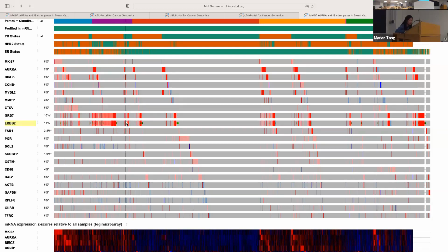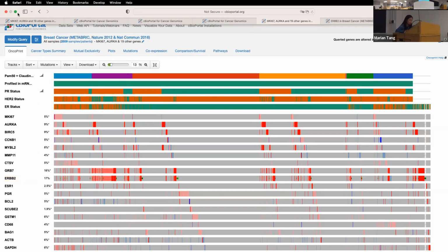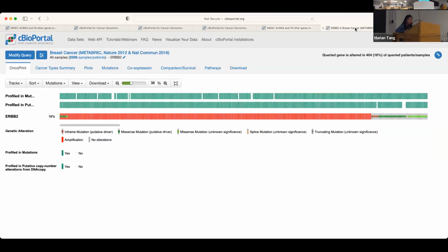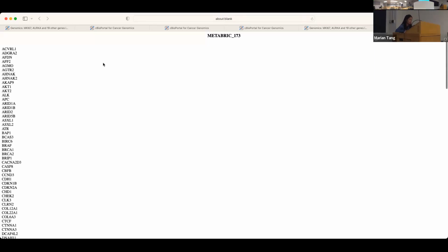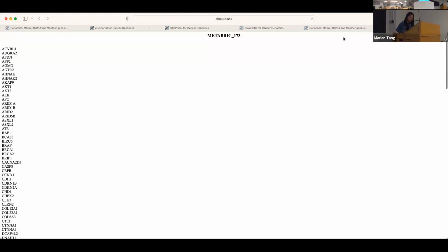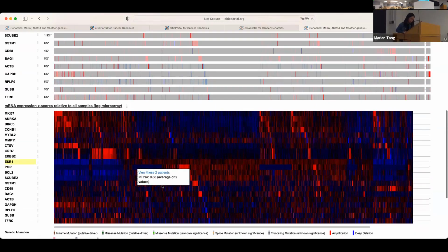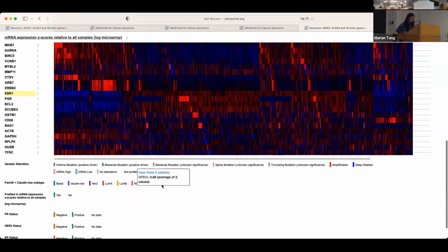So now you can see there's this field called gene panels. So if we click on it, oh shoot, what did I have? Sorry, there was supposed to be a pop-up. Oh, sorry, here. Yeah. So this was the pop-up. So this will tell us these are the genes in this gene panel. So that is what that means. So there's a lot of exploration to be done here. It's very interactive in this tab.